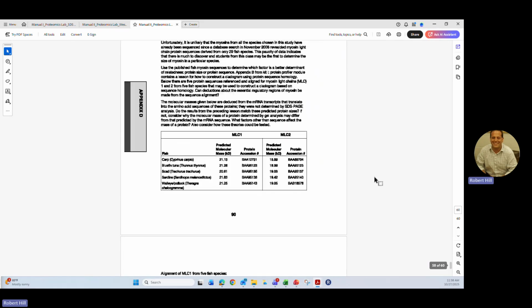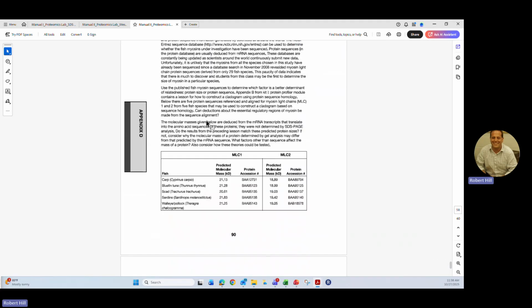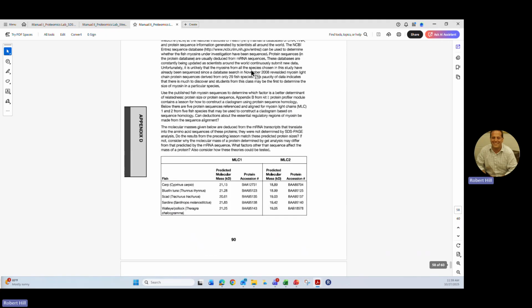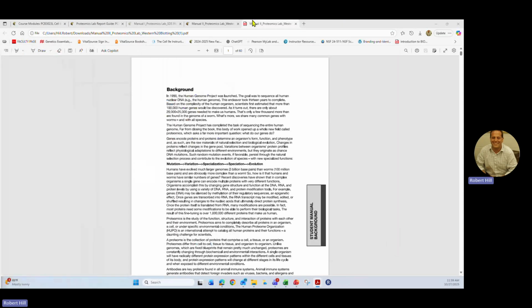Yeah, so 90 to 92 is going to explain to you about how to get these sequences. So I'm going to walk you through that a little bit here.